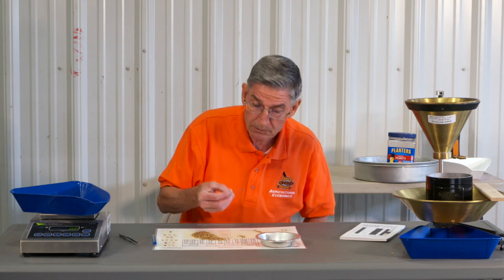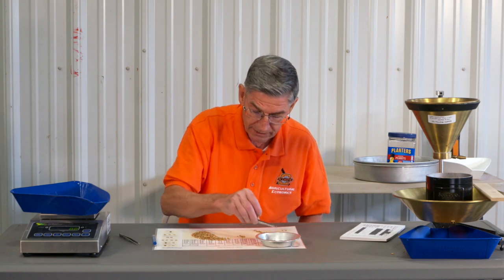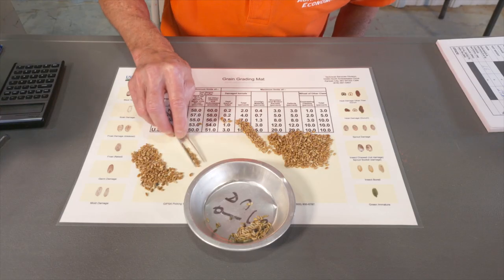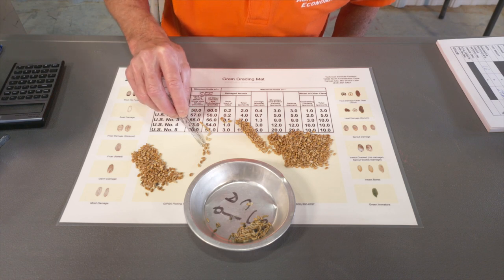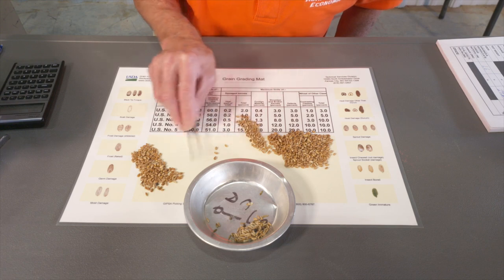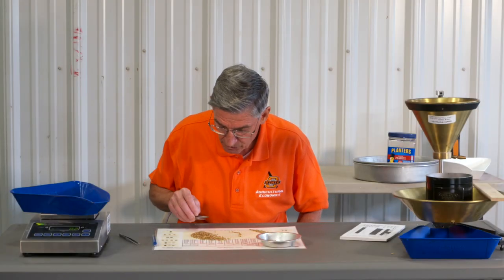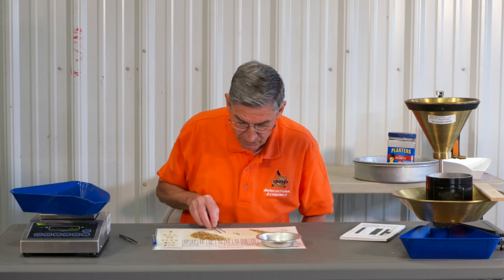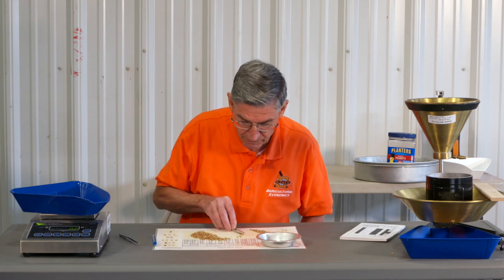I've got some rye in here — they have a little pointy end on them — and some other non-wheat materials, looks like some vetch and another little seed. I go through and pull it out one line at a time. That way you can spot the rye kernels with the little pointy tips and get all of them out. If you're just poking around in a pile, you're going to miss a lot. After doing this a while, you can work relatively quickly.